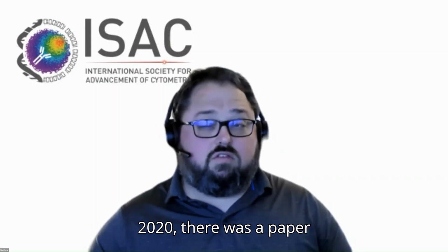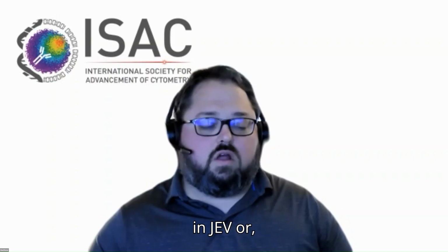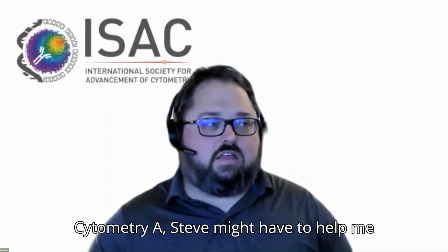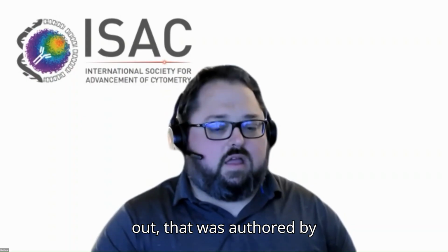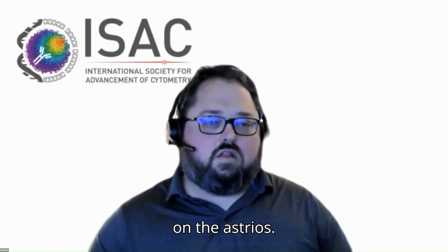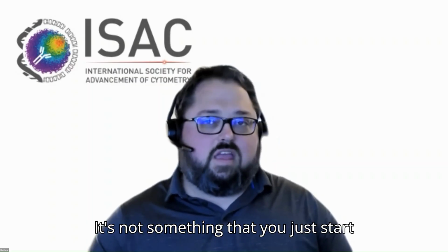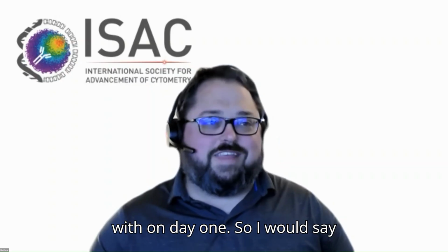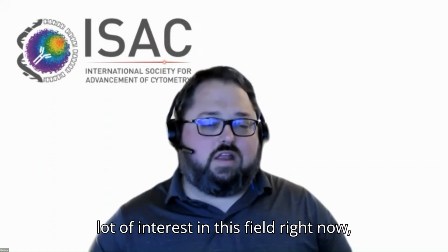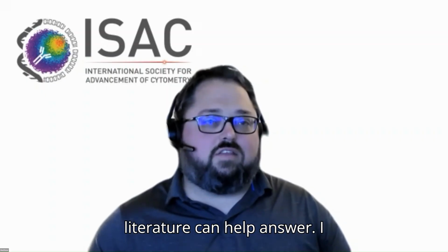I think it was in 2020, there was a paper published, and I can't remember if it was in JEV or Cytometry A. Steve might have to help me out. That was authored by Jennifer Jones, Josh Welsh, and several others, related to sorting on the Astrios. And to do that was an incredible effort. It's not something that you just start with on day one. So I would say keep looking at the literature. There's a lot of interest in this field right now, but in terms of pragmatic tips, I think that that's very much an in-flight thing that the relevant literature can help answer.